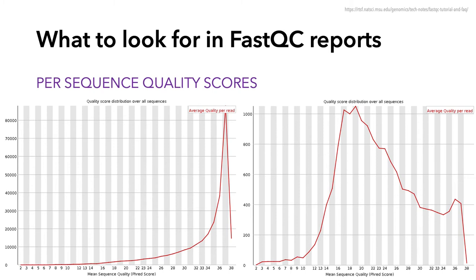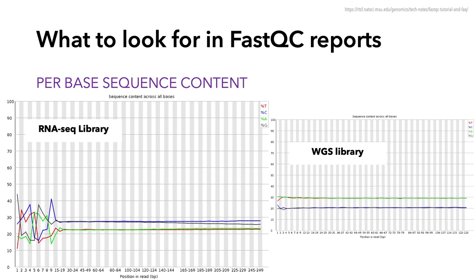The next module is per sequence quality scores. These generate plots showing the number of reads versus the average quality score over the length of the read. Ideally you'll have a heavily left-skewed plot like on the left here. Lower quality samples will have more broadly distributed Phred scores. This is one of my favorite plots for doing a sanity check after quality filtering or trimming, because you can see the distribution change after removing those low quality reads.